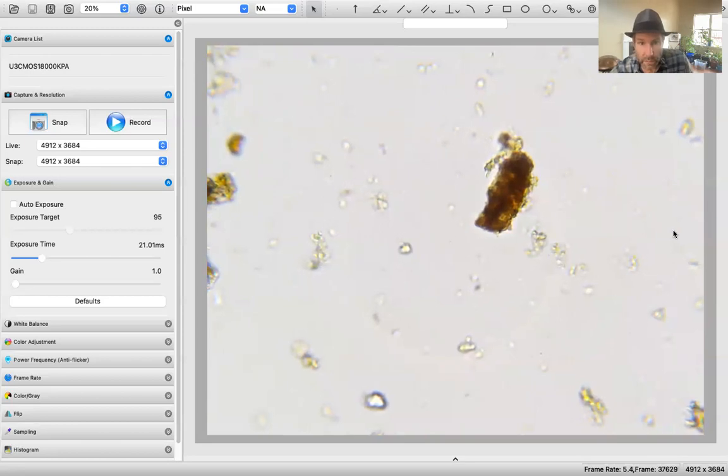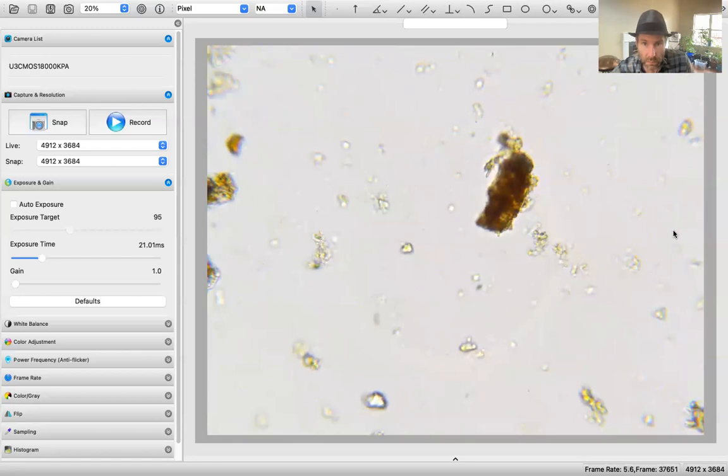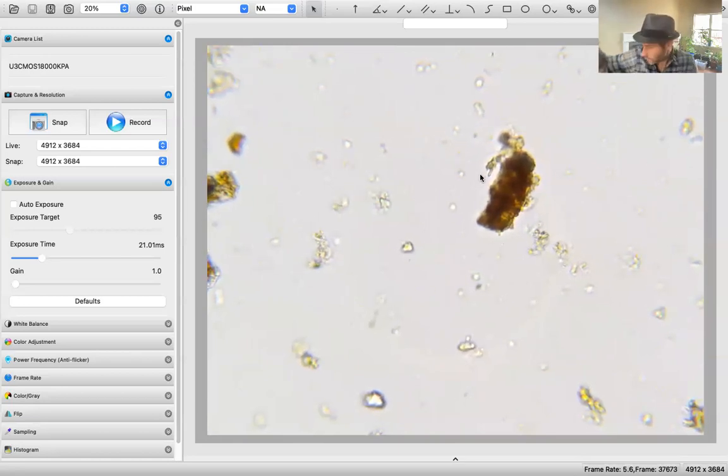Ooh, some actino right there too. My goodness gracious. Right there's where it is. Just so you guys can see. Right there. And it's about, I want to say 1.5, so 0.15.